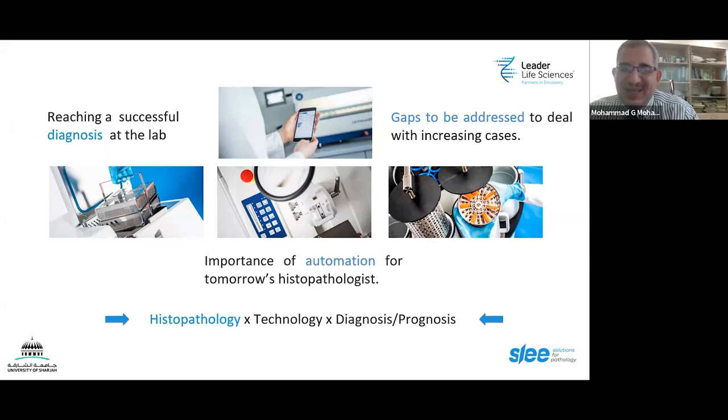Personally, I prefer to get the students through the manual part first, to get into all of the hectic things related to the manual part, and also to get into those problems that they might encounter, the troubleshooting, how they do it. Once they master these, it will be easy for them to appreciate the importance of automation. And you know, appreciating things comes from really experiencing the hard thing.